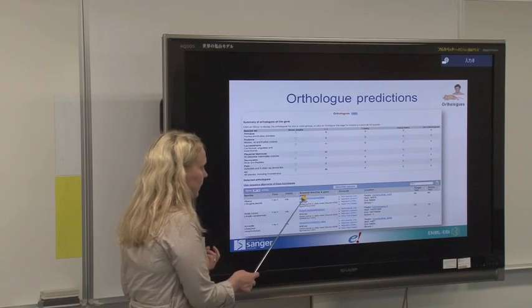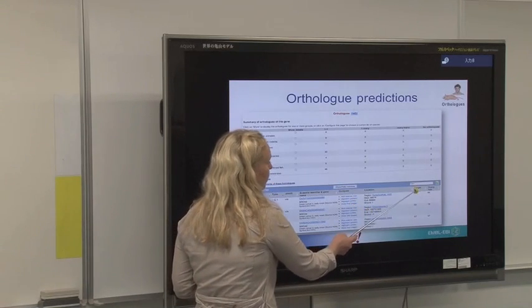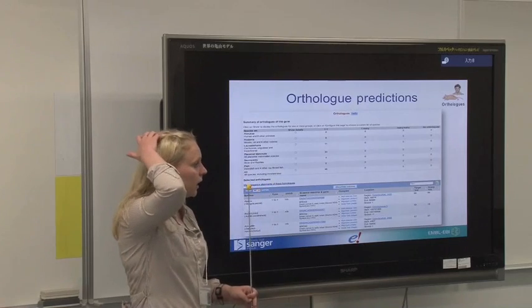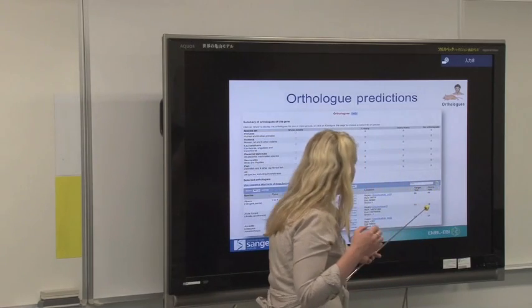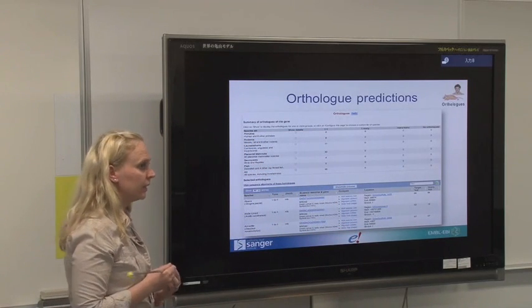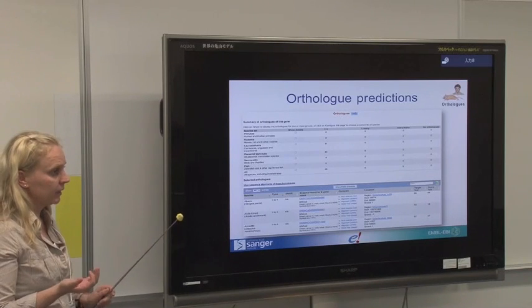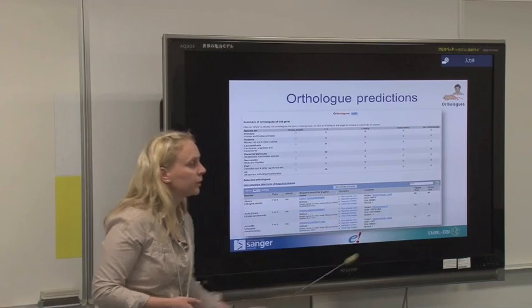Linked to the alpaca genome description, you can see the individual alignment. And it also tells you the target and query similarity. Can anyone guess why these are different? Well, in this case, they are similar, but here, what is target and what is query similarity? We all understand what similarity is. I have two proteins and I calculate how many amino acids or nucleotides are represented in both. So how come I get two numbers?